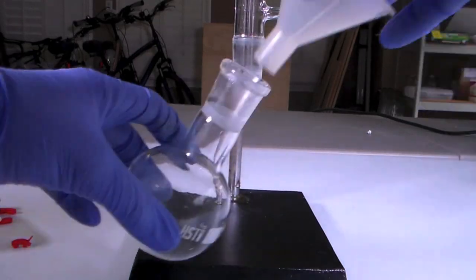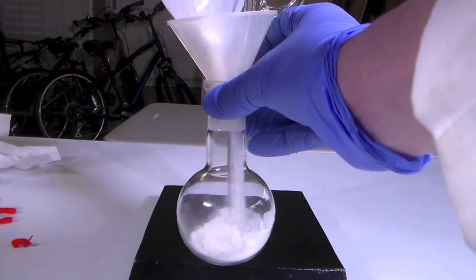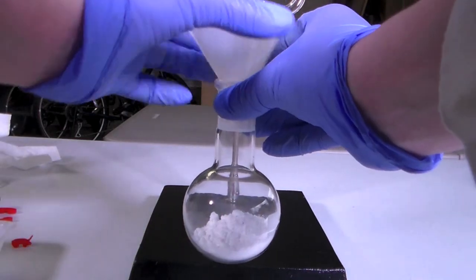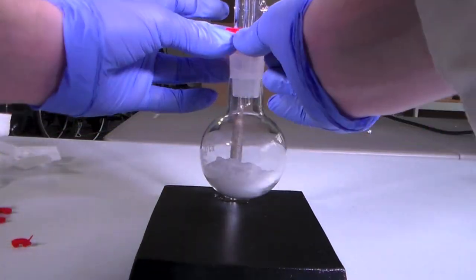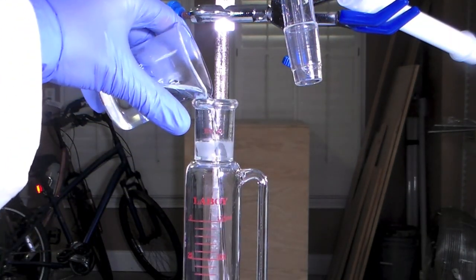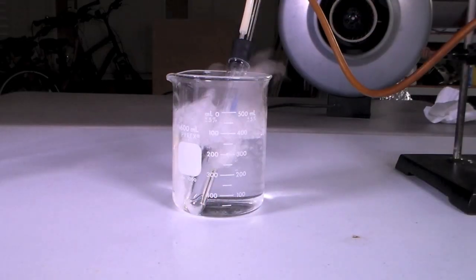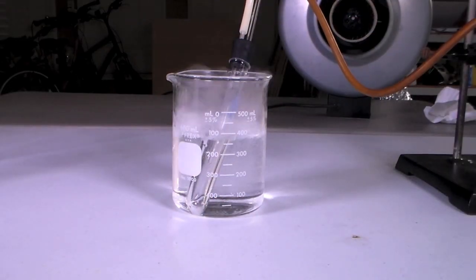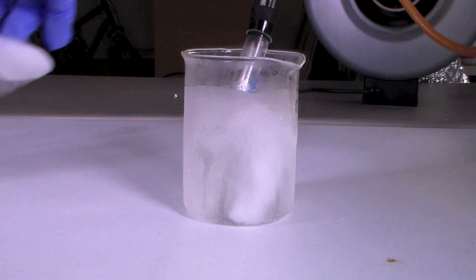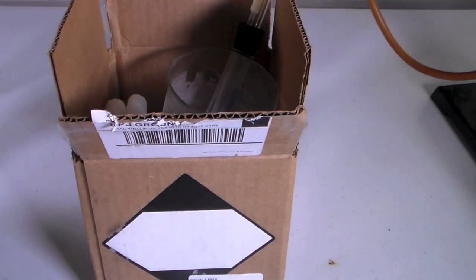To generate the chlorine gas, I first add 40 grams of TCCA, or trichloroisocyanuric acid, to the chlorine generation flask. I then add 50 milliliters of 31.45% hydrochloric acid to the addition funnel. To liquify the chlorine, I am using a bath of dry ice and acetone. The bath is insulated with styrofoam to make sure that it stays cold.